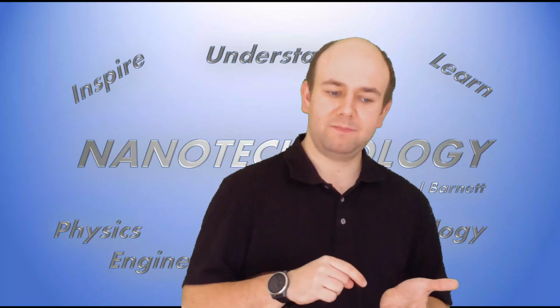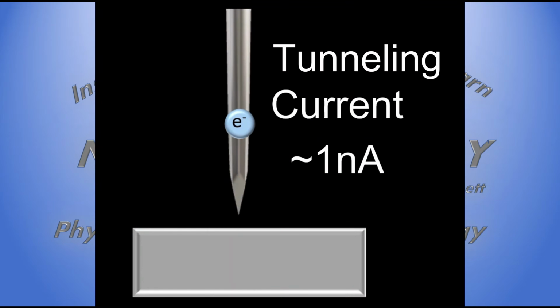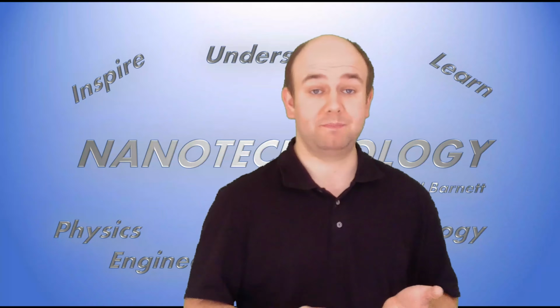But what we mean as far as STM is concerned is when the tip is very close but not in contact, so we're talking less than a nanometer, the electron jumps from the tip into whatever the sample is, and that little air gap of less than a nanometer is the classically forbidden region. So this does produce a current, the tunneling current, but it's very small. It's normally in the region of nanoamps.